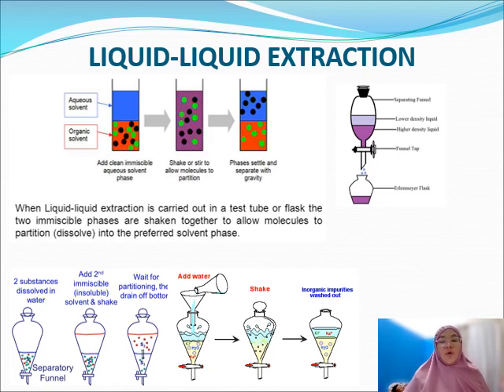So what will be collected here is that in the organic solvent part that you added earlier, the hydrophobic molecules will collect. The components that do not like water will be partitioned at the organic solvent area.